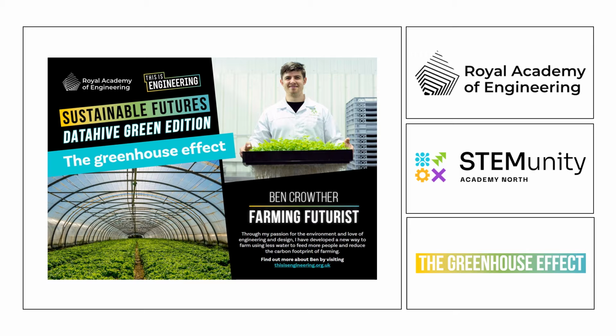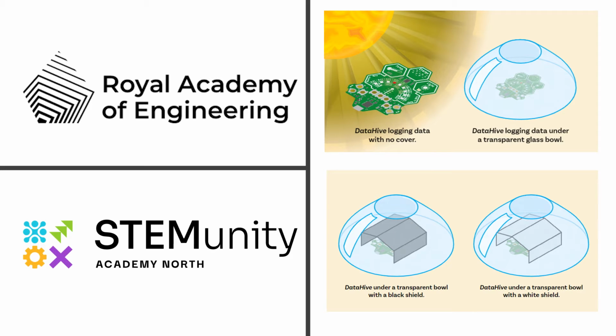Using the Data Hive to measure global warming. In this experiment, we will be looking at how the Data Hive can be used to measure temperature changes in different conditions to model global warming. This experiment can be used in biology, chemistry, and geography.